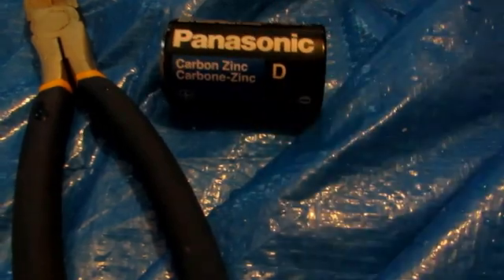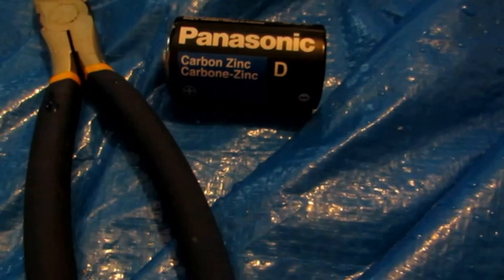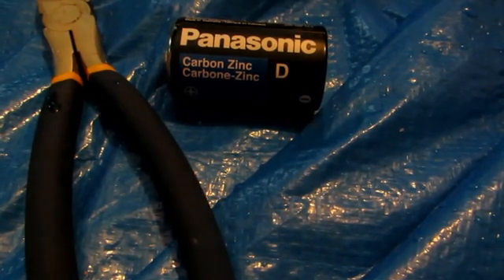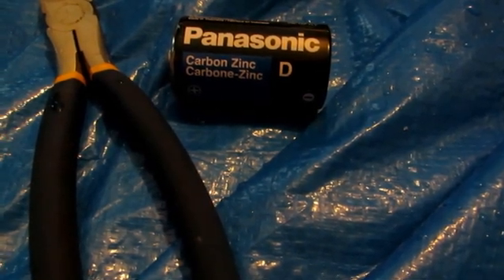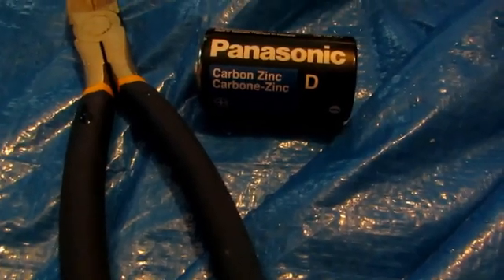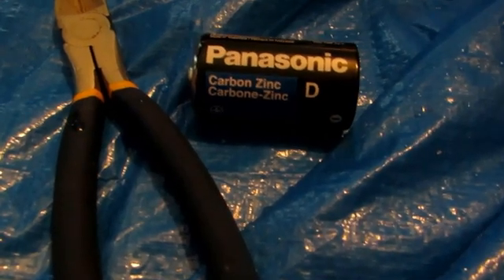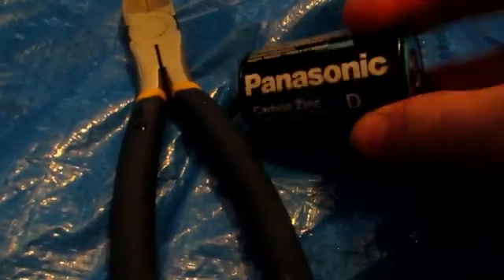You're going to want to use a brand new battery so that the zinc won't be corroded. You can also find zinc inside of old lantern batteries, which are also carbon zinc batteries, and some 9-volt batteries which can also be carbon zinc batteries. Basically anything that says carbon zinc on it will contain zinc metal. Just make sure it's new so that the zinc isn't corroded.